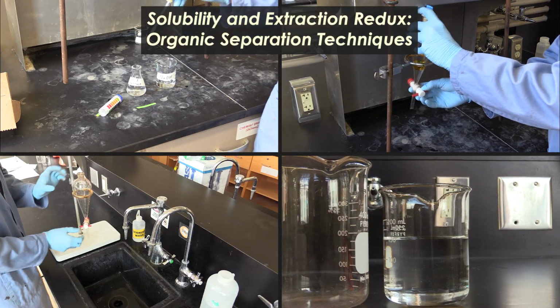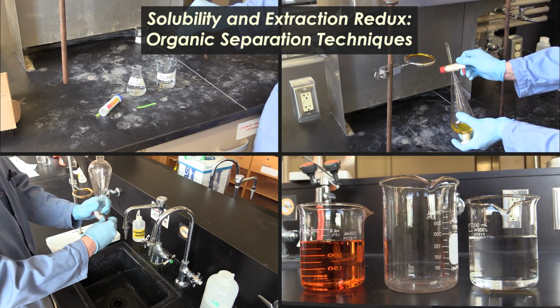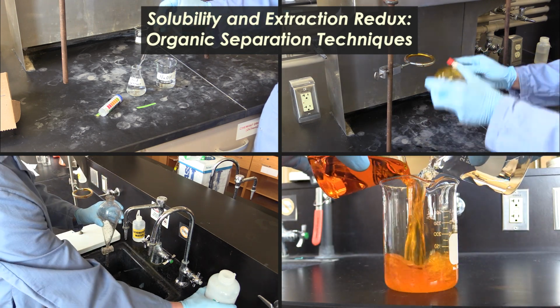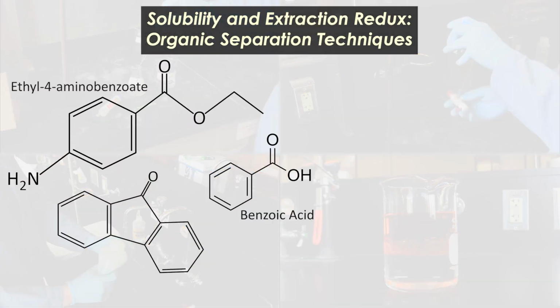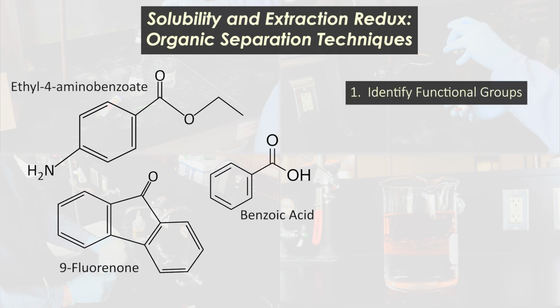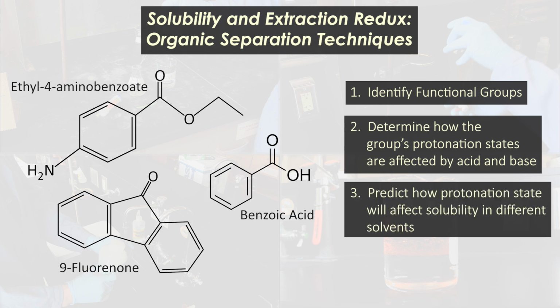Depending on the semester you take this course, you may perform the follow-up experiment, organic separation techniques, in another lab period. This experiment is similar to the one I just described, but instead of exploring the solubility of benzoic acid in different conditions, you will use liquid-liquid extraction to separate a mixture of 3 compounds. The secret to doing this is to first identify the functional groups in these compounds, then determine how these groups' protonation states will be affected by acidic and basic conditions, and then predict how the compounds' protonation states will affect their solubilities in aqueous and organic solvents.